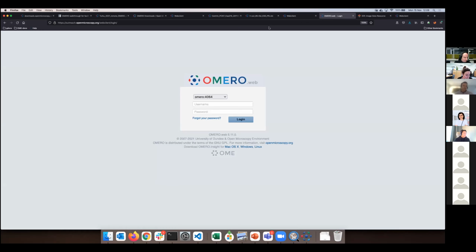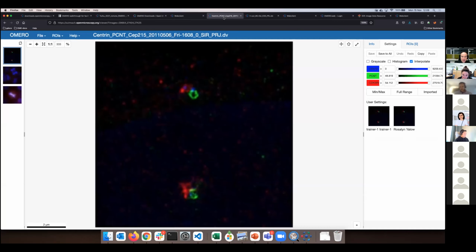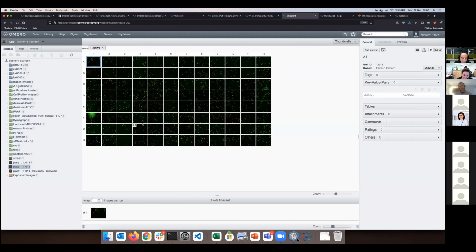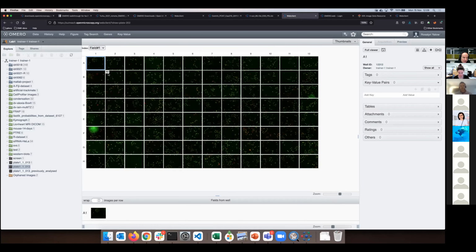Okay, so if that is clear, let me just wrap up on what, because yeah, I'm constantly jumping away from this plate just to nail it down. And thank you for all the questions and interruptions. I mean, that's why we are here actually.